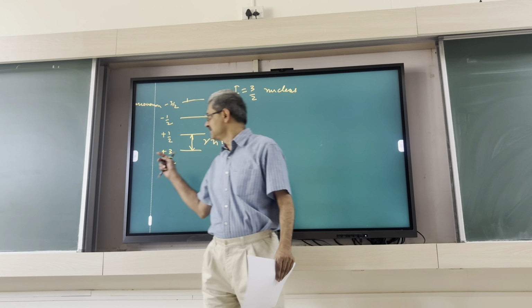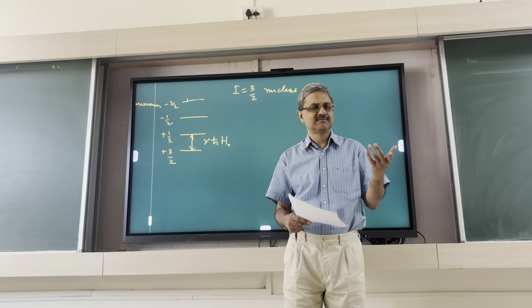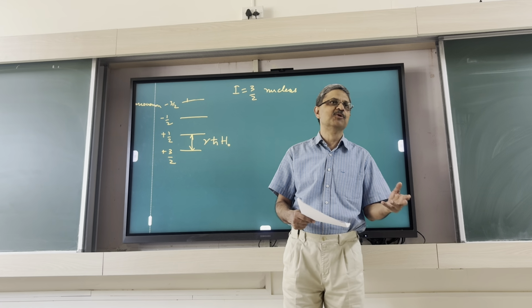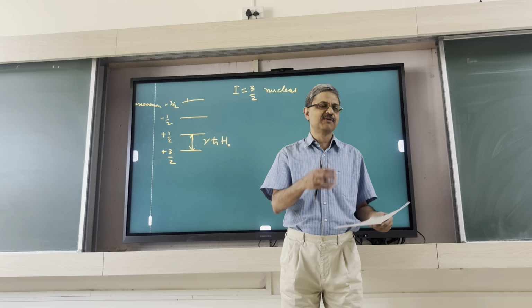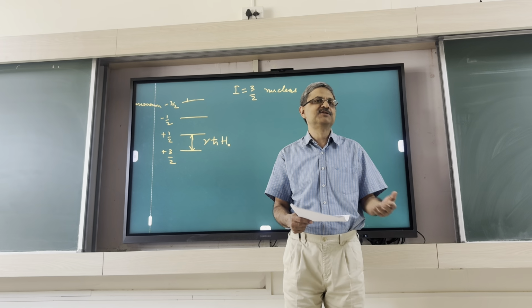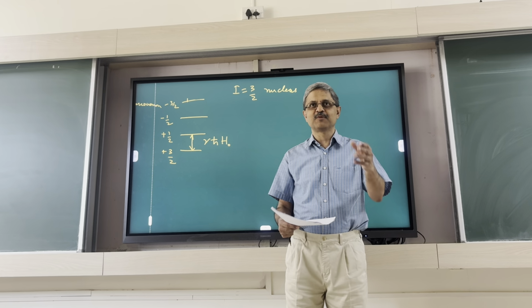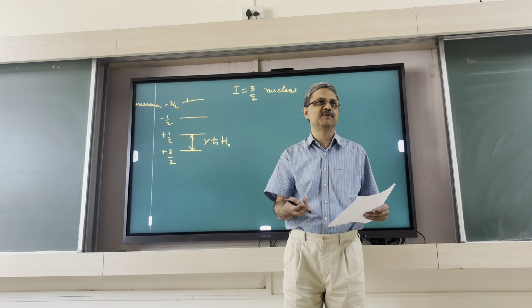Suppose a Tesla field is giving some electronic signal of volts. Then if you have millitesla, it will give millivolts, loosely speaking. Even smaller will give maybe microvolts. We just need some good detection mechanism which can amplify that. So it's not impossible. SQUID, you're familiar with SQUID devices. They have very great sensitivity to magnetic fields.